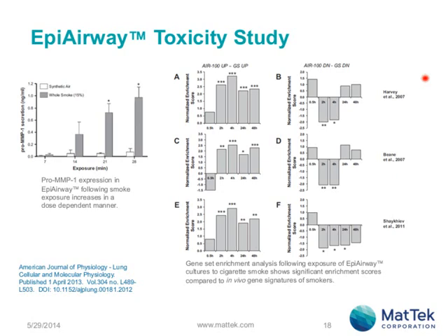So based on these results, the investigators concluded that EpiAirway tissues exposed to cigarette smoke are a valuable tool that can be used to further understand the biological impact of cigarette smoke on lung epithelium.